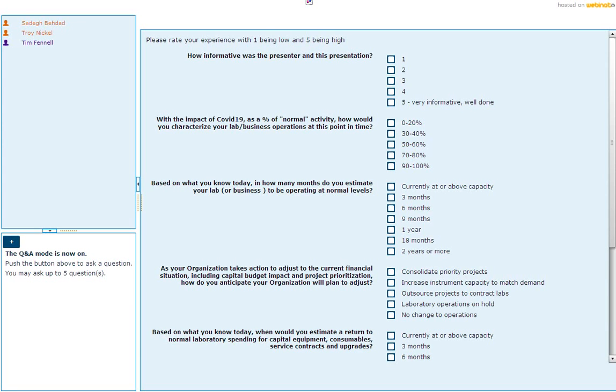Yes, there are actually two models of that instrument. That's a very good question. So you have a HPTGA 75. That model only has a one gas flow controller, but on 750, which is a more advanced version of that, you have three reaction gas connections and three independent mass flow controllers. So it allows you to create a blend of your own with those three gases. So that's an option that is available to you there.